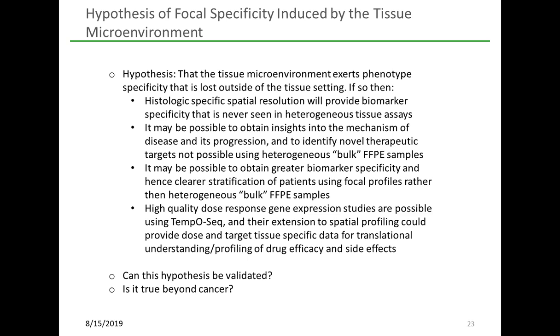That means using focal profiling, it's possible that one could get high-quality dose-response expression studies carried out at the level of spatial profiling to understand how a target histology within a tissue is affected by a compound or drug, not only for translational studies, but also to determine drug efficacy and side effects for drug discovery as well. So whatever you can do with a bulk, you potentially can do at the level of spatial profiling.